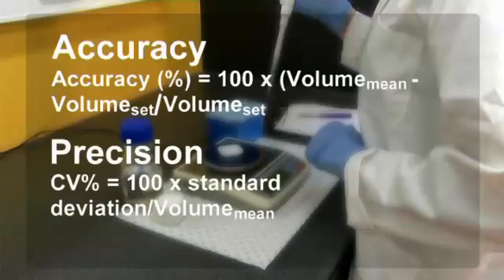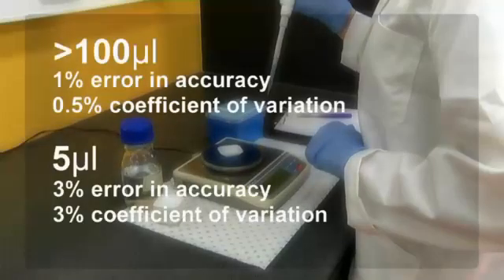After doing this you can calculate the percentage accuracy and the coefficient of variation for each set volume. You should expect less than 1% error in accuracy at the higher volumes, that is volumes greater than 100 µL, with a coefficient of variation of less than 0.5%. At about 5 µL accuracy will drop to about 3% and the coefficient of variation to about 3% also.